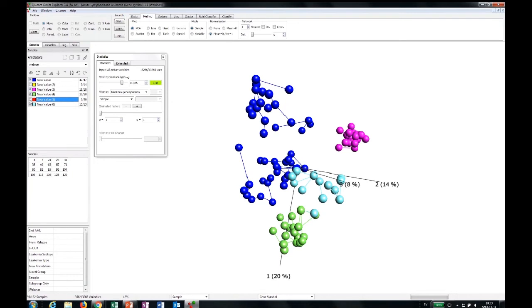So you get some basic information here, the data set that you used, your own text, you can write as much as you want, then exactly the calculations that were applied to the data set. Then you get a list of the sample annotations that weren't included. So details exactly on how you have treated the data set.